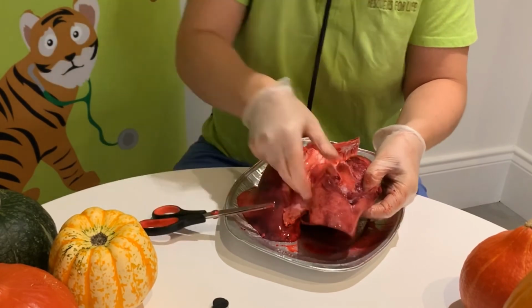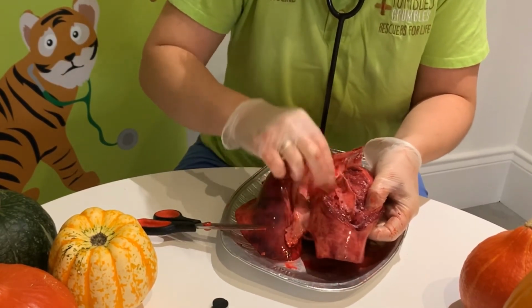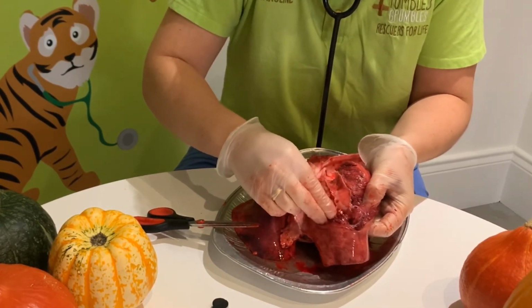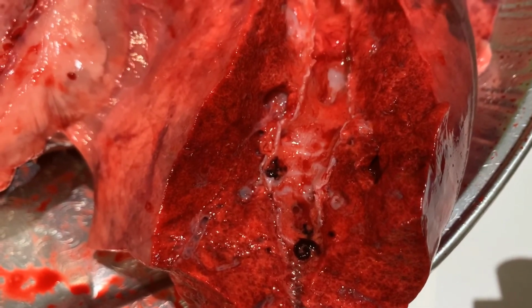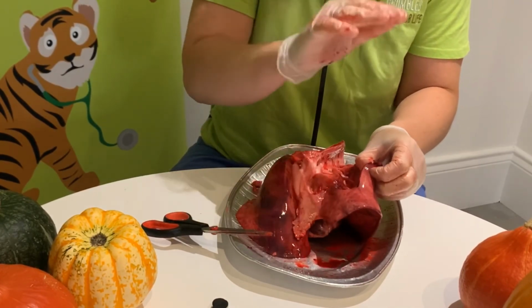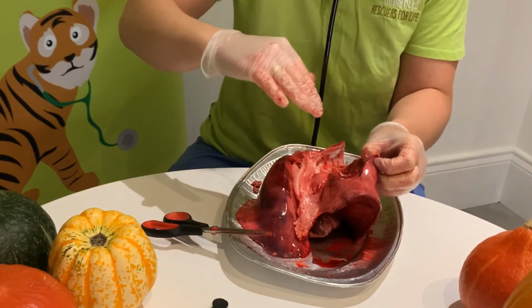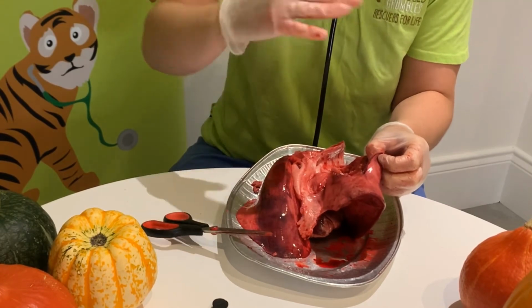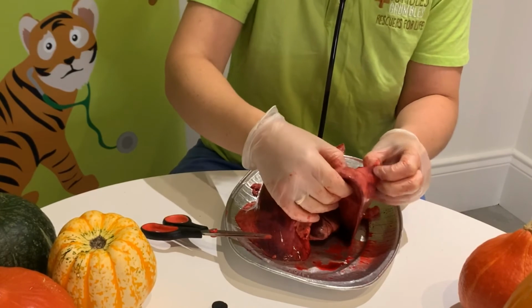And when you see inside, you can see that after that bronchus is finished, there are these smaller little bronchioles, those smaller little tubes that carry the air further into the lungs. And then, right on the surface, we've got the alveoli, that really 1-cell thick alveoli sac where the air moves across into our blood. The oxygen that we need moves into our blood. It's called diffusion. It moves from high concentration into a low concentration, okay?